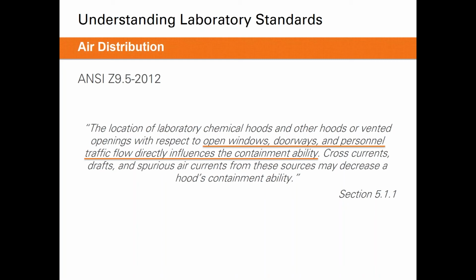So even things like open windows and open doors and people walking in front of the fume hoods can actually create enough cross current or enough turbulent airflow in front of the fume hood to decrease the hood's containment ability. So again, when laying out the room, it's important to understand where those fume hoods are going to be placed in relation to all of those things, as well as your supply diffusers.